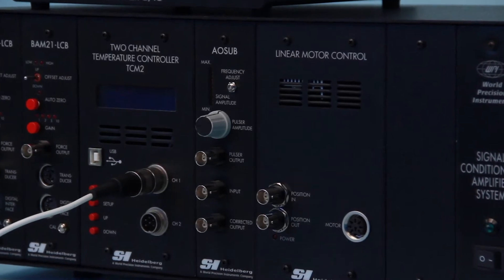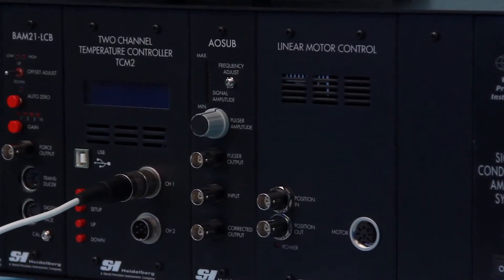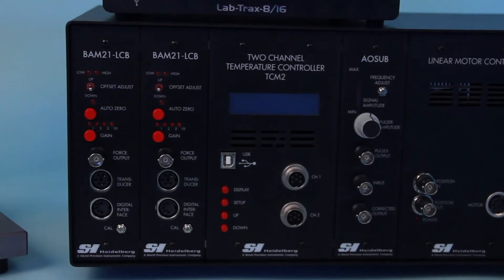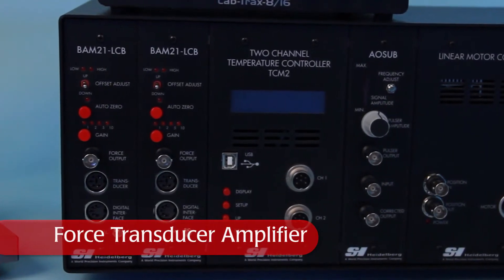When recording very small forces with a very sensitive transducer, the resonance frequency on the transducer needs to be filtered from its output signal using an anti-oscillation filter. When the modular version of the anti-oscillation unit is mounted in the same frame as the BAM21 amplifier, these two modules are connected internally.